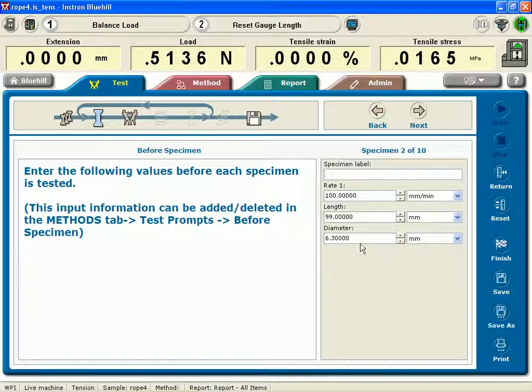This is a circular rope of about a quarter inch diameter, 6.3 millimeters, 99 millimeters long.